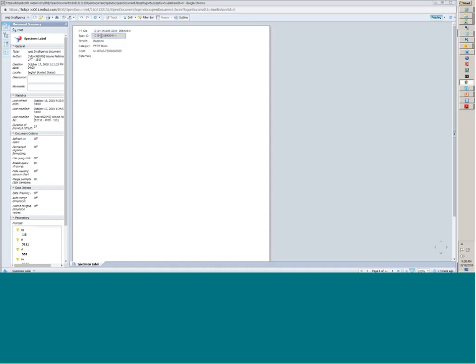Down, the second line contains the specimen ID. It's generated by the system. And every specimen that's shipped to the biorepository needs to have the RAVE-generated specimen ID on it. So that's why this label is important. We also have the time point, the specimen type, the FFPE block, and then there's a code list here.